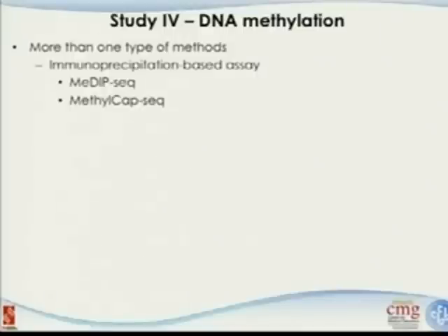Okay, we talked about three different studies: transcription factors, histone markers, and enhancers. The next one is DNA methylation. To be fair, this shouldn't be called ChIP-seq, because the first ChIP stands for chromatin immunoprecipitation. Here you are using different ways to target the samples, which we'll talk about in the last lecture, which focuses more on epigenetics.